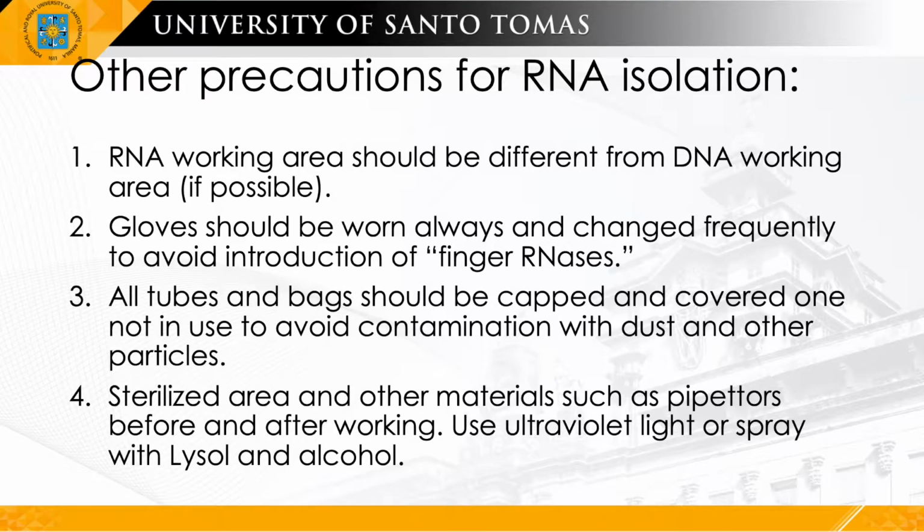And as a working hypothesis to explain the initial losses, it was assumed that traces of nucleases were being encountered during the experimental procedures. And true enough, after doing the experiment, after trying to identify these, we were able to identify finger RNases. So you should wear gloves, and of course you should wash your hands regularly.